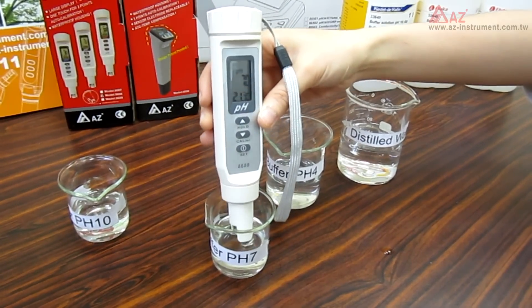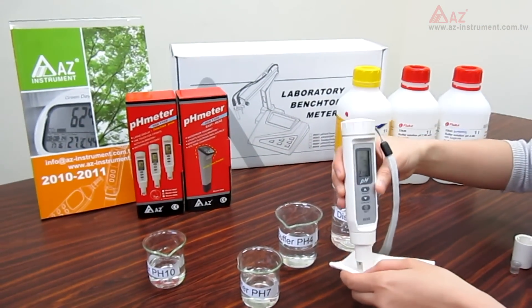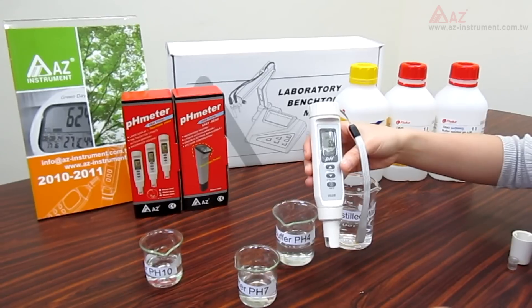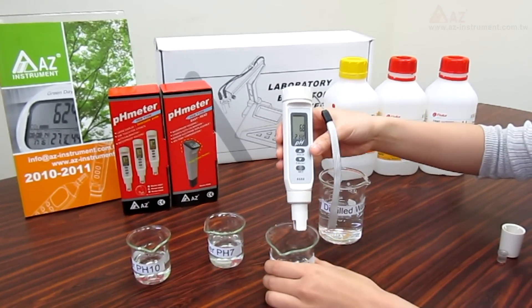Now we have done the pH 7 calibration. Just clean the electrode with distilled water again, and you can proceed with the calibration of pH 4 and 10 following the same procedure.